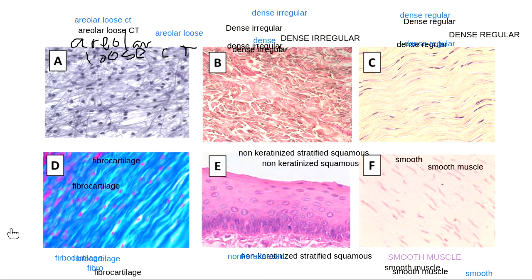But I would think that some of the same structural features would be there, right? Did that one have, could you see those intercalated discs, for example? Or the branching cells or the striations? Generally speaking, regardless of exactly what a slide looks like, there should be the same anatomical features there.